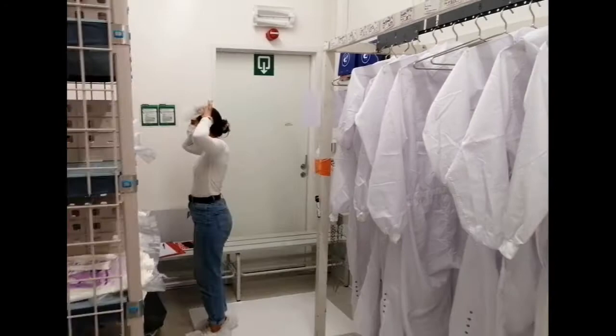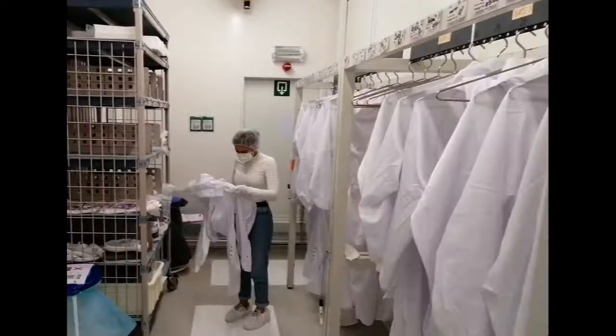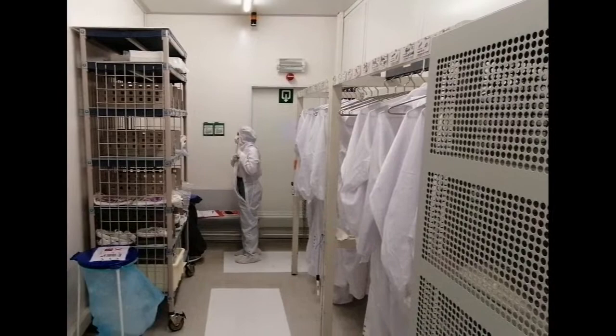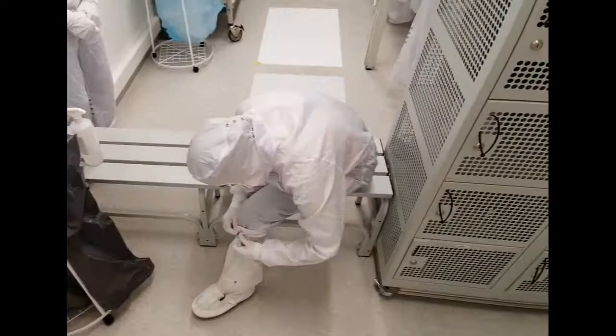The MNS Cleanroom is designed to protect samples from dust contaminants, temperature and humidity variations. The class of this cleanroom is ISO 6. The user of the cleanroom enters via the gowning area and puts on appropriate cleanroom clothing, leaving behind any contaminated object.